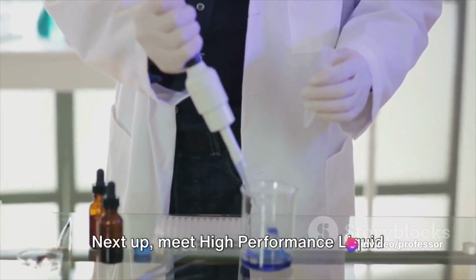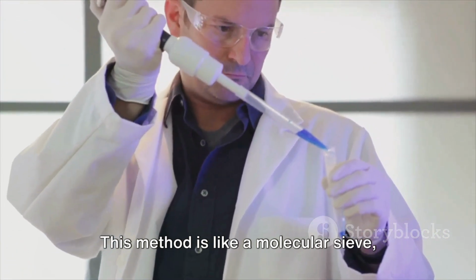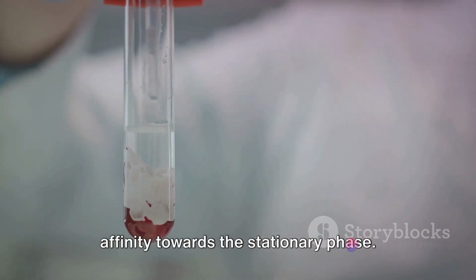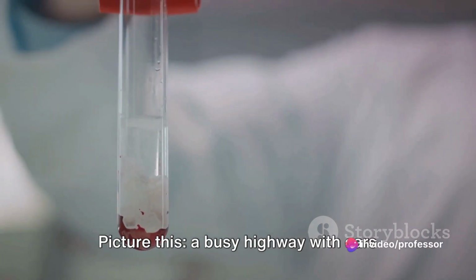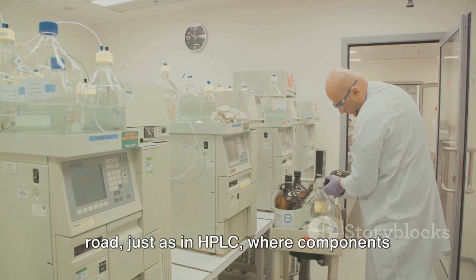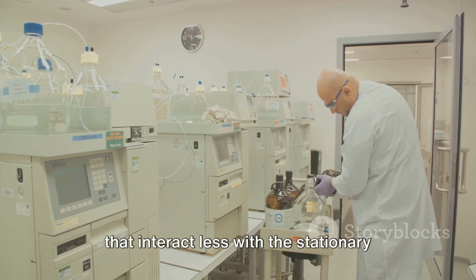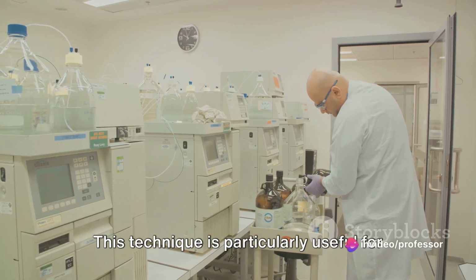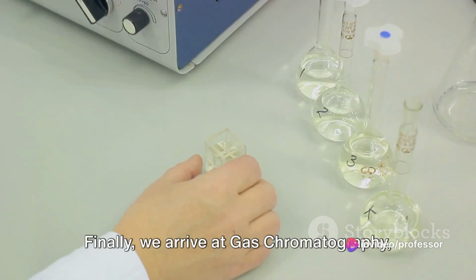Next up, meet high-performance liquid chromatography, or HPLC. This method is like a molecular sieve, separating components based on their affinity towards the stationary phase. Picture this: a busy highway with cars zipping past at different speeds. The faster ones are less attracted to the road, just as in HPLC, where components that interact less with the stationary phase move faster. This technique is particularly useful for separating components that are similar in polarity and molecular weight.